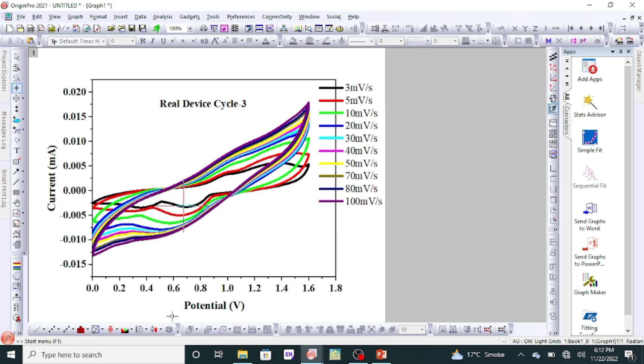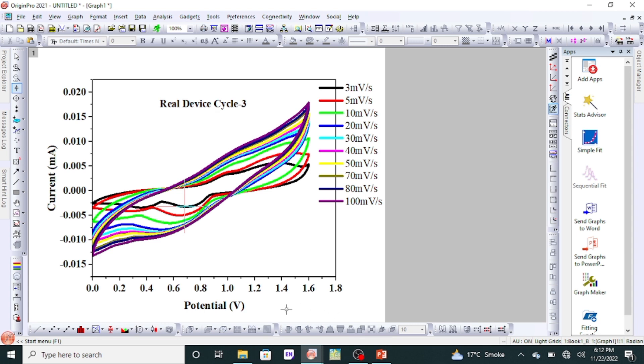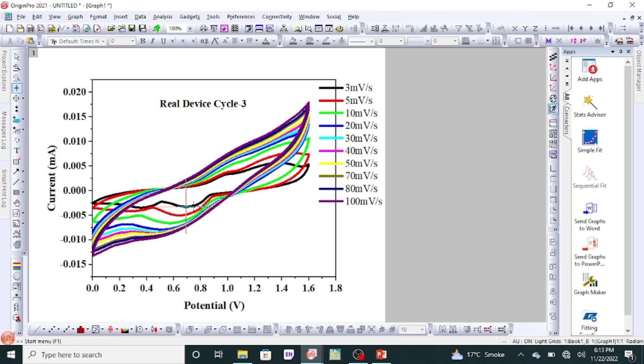When you take the screen reader on these scan rate curves, you will see a box here where the values of x-axis and y-axis will be given. Unfortunately, my screen reader is not showing, but luckily I have already collected these values at 0.7 volt. When we place the screen reader on the curve and move it to our desired voltage, approximately you can see 0.7 volt, and then you will see the value of current.